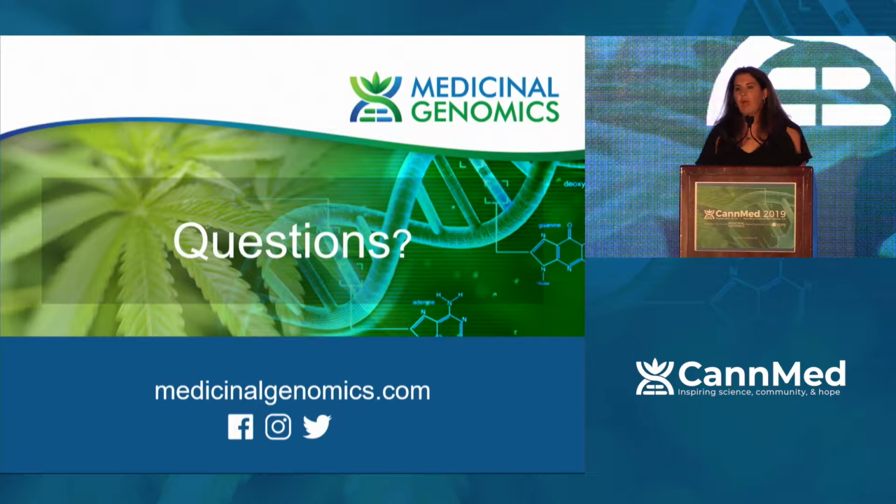So it depends. If you had a major Aspergillus contamination, which produces mycotoxins, then yes, I think it would be a concern. I'm not sure. Every state has different rules in their regulations as to whether if they fail, can they go back and be remediated and tested again. I was under the impression that in California, it doesn't matter if it's live or dead, but I could be wrong. So I think it depends. But there are other regulations that do test for mycotoxin testing. So if it was dead and left something behind, I would think it would come up positive there.